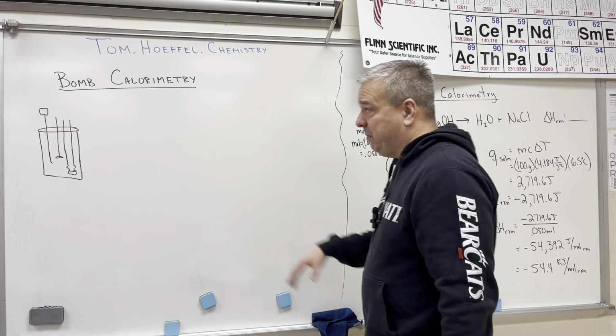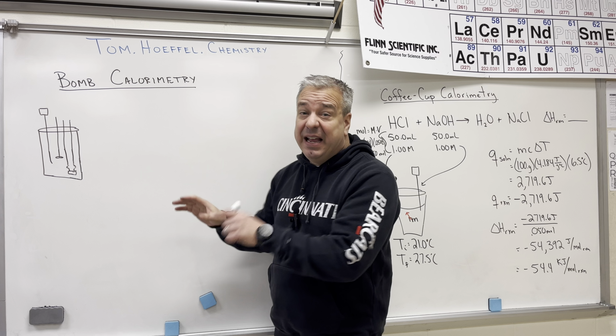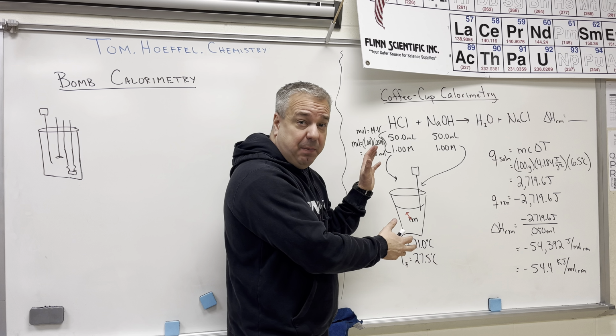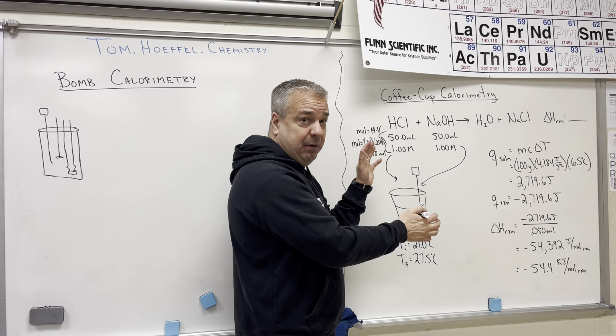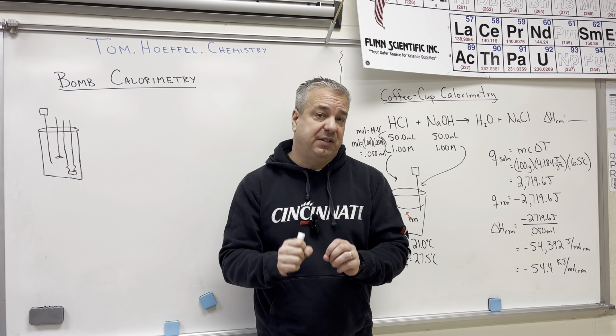In this video, we're going to be talking about bomb calorimetry. And bomb calorimetry is so similar to what we've been doing in the last couple videos with coffee cup calorimetry. There's plenty of similarities, but we're going to talk about the differences as well.